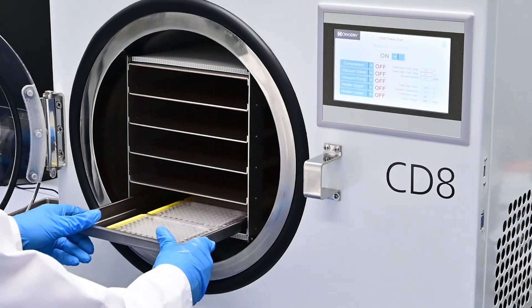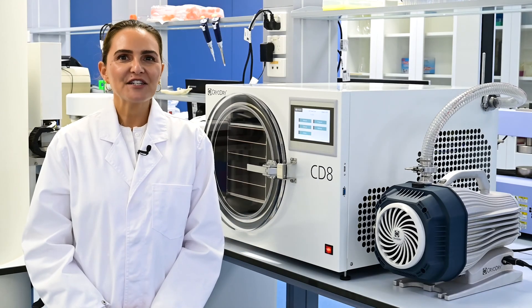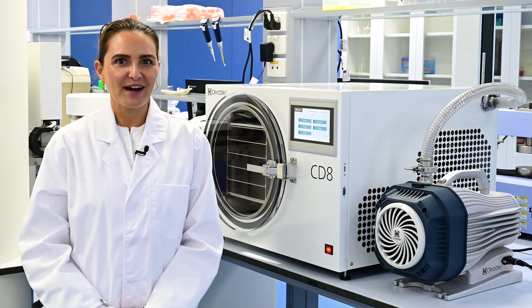Loading and unloading of the CD8 is a breeze. Interested? Reach out to CryoDry and join our community of happy freeze-dryer users.